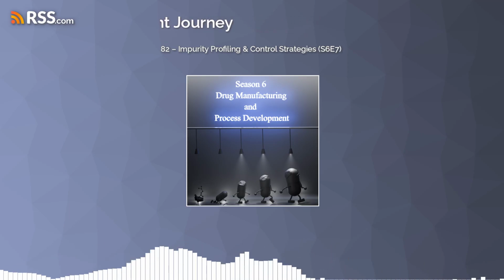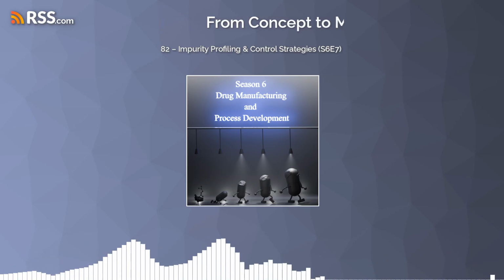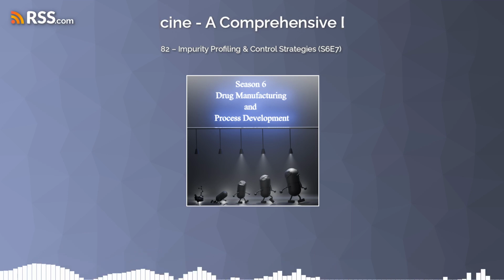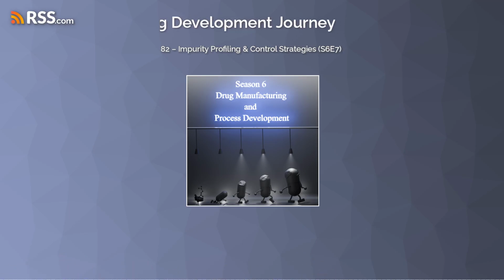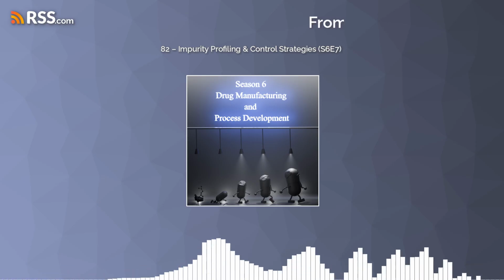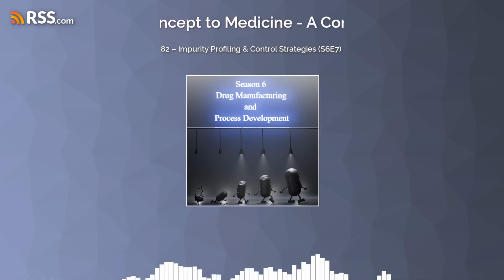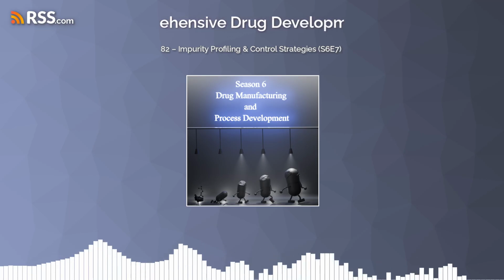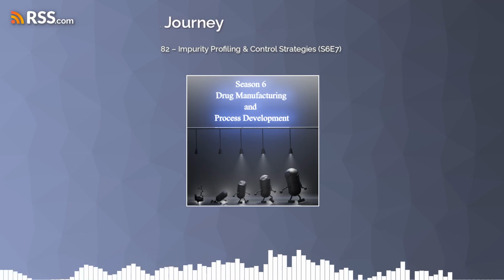Now, shifting gears a bit, let's talk about another kind of impurity that might be lurking. Elements. For this, it seems ICP-MS is the tool of choice. Inductively coupled plasma mass spectrometry. So we're talking about things like detecting metal residues or other elemental stuff. Spot on. ICP-MS is the go-to for measuring elemental impurities in drugs. And these could come from various sources. Maybe there was a metal catalyst used during synthesis and some of it stuck around. Or maybe it's naturally occurring elements that were in the starting materials. Oh, so it's not always contamination in the factory sense. Not necessarily. Sometimes it's just inherent to the stuff they're working with.